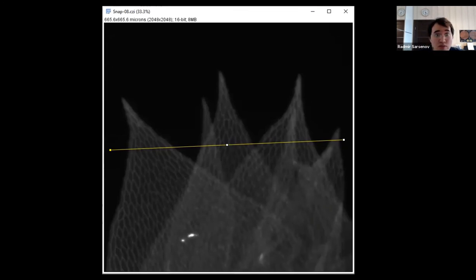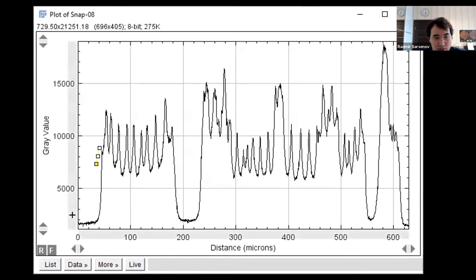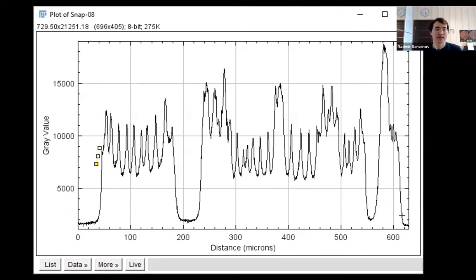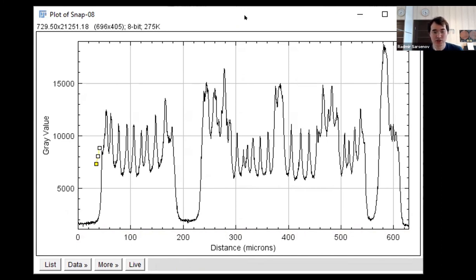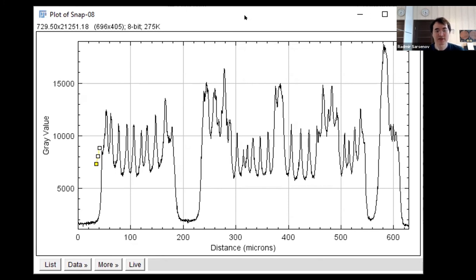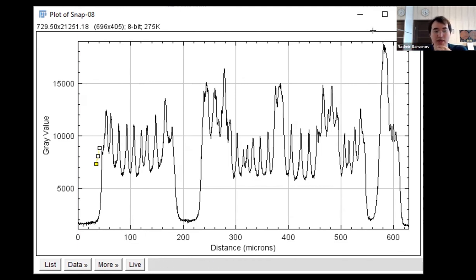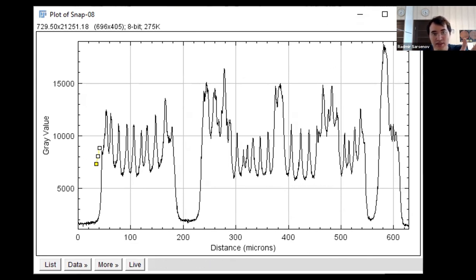When we go back to our plot, here you can see the distance in microns, the start of our line and the end of our line. The thing about ImageJ is that it gives you an overwhelmingly huge amount of information. You will never see any other image editors, especially the ones provided by huge companies like Zeiss or MetaExpress. They kind of cap your abilities in these official applications. That's why ImageJ was created to overcome this burden.